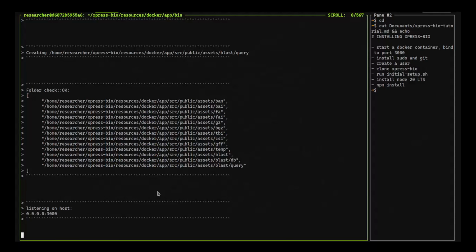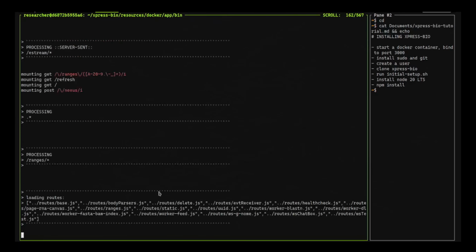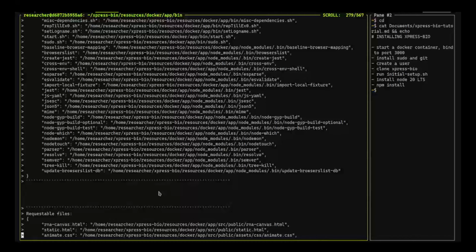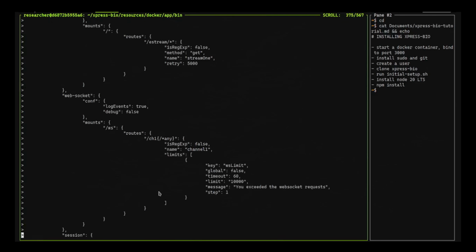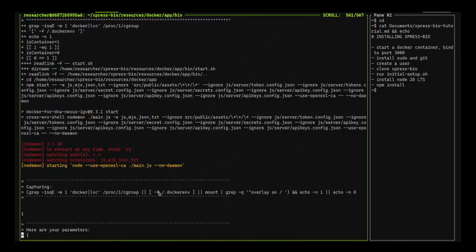The output is a little bit verbose. You could have redirected that to a log file or just silenced it, but I prefer to go over all the information that it outputs for you so that you have an idea of what's going on. So first of all, it gives you the final configuration. There you go.